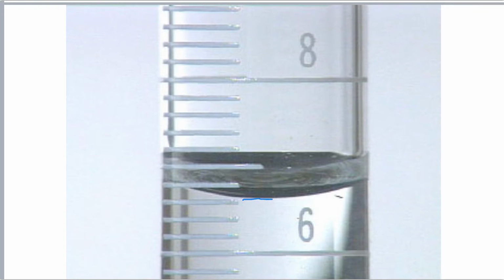So you're going to look at the very bottom here. So that's going to be roughly there. And you're going to say maybe that's 2/10 of the way between this line here and this line here. So we're about 2/10 of the way up here. So what do we have here? So this is the 6 mil mark. This is the 8 mil mark. So this is the 7 mil mark. And let's see, there are 2, 4, 6, 8, 10.